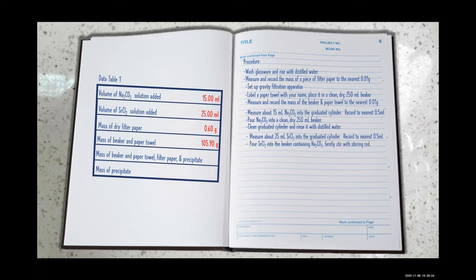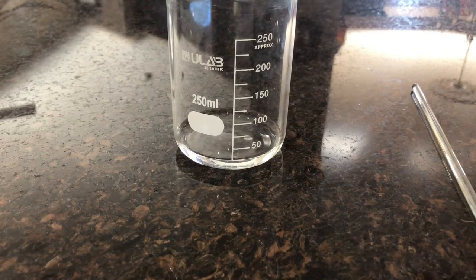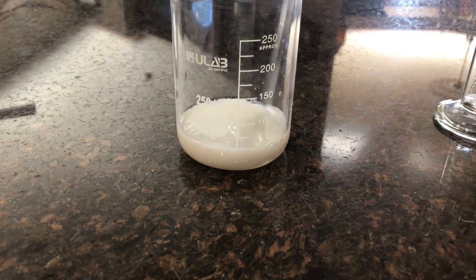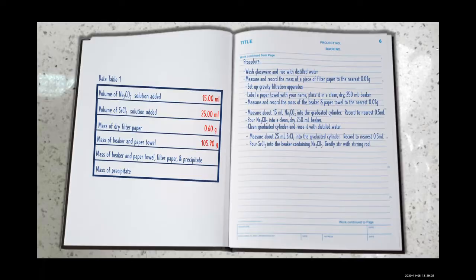We will pour the strontium chloride into the beaker containing the sodium carbonate and gently stir it with a stirring rod. Next, we'll measure another 10 milliliters of strontium chloride into the graduated cylinder and record it to the nearest 0.5 milliliter.